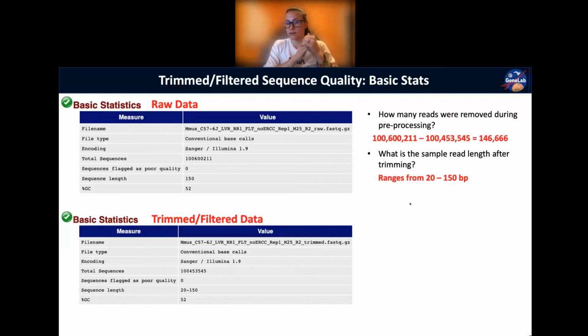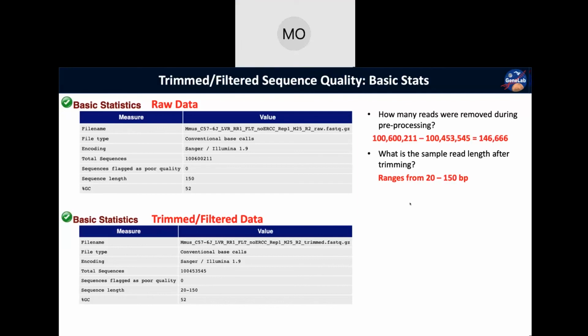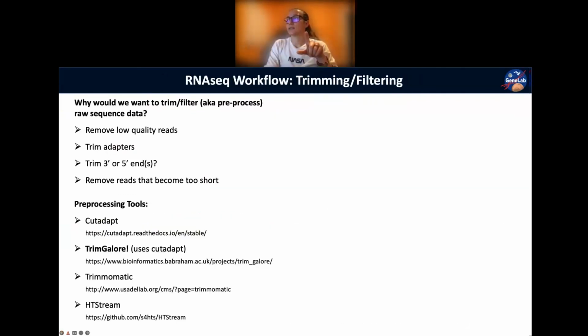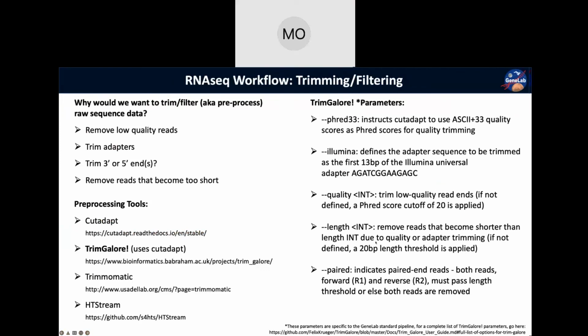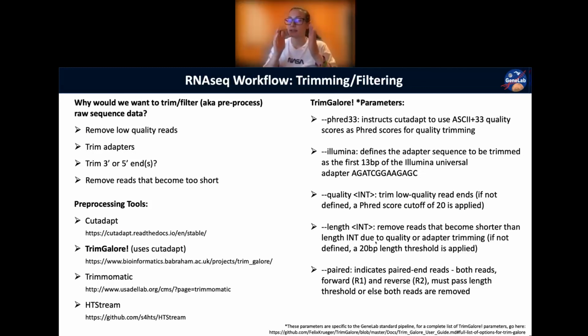Because that's the shortest it can be without getting sequenced with a bunch of other places. That's true, but specifically, we set that, right? In this length option for Trim Galore, we tell it how long a read has to be for us to keep it: at least this length.